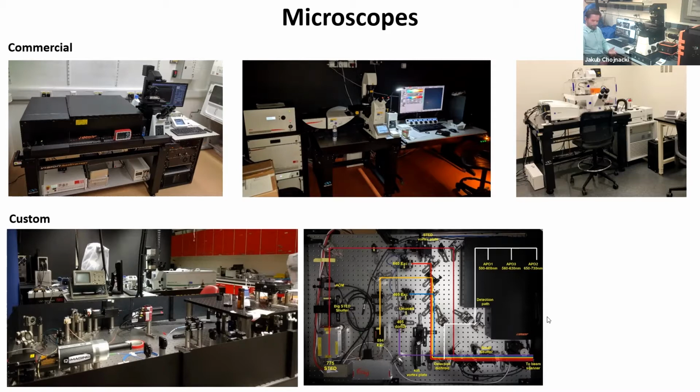which we actually use to excite the molecules. Because what I forgot to mention is, how do we excite those fluorescent molecules? We use lasers with a very specific wavelength, corresponding to the absorption spectra of the fluorescent dye. So we also have the possibility to build microscopes, and it's a little bit like playing with Lego blocks. Putting all these components on a board, on a table, is a little bit like playing with Lego blocks.